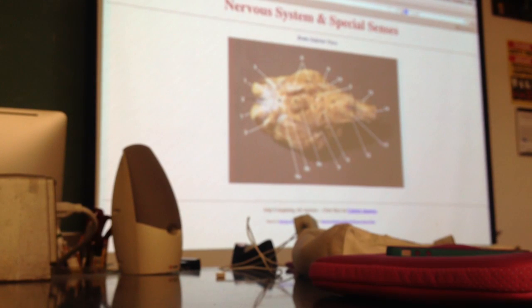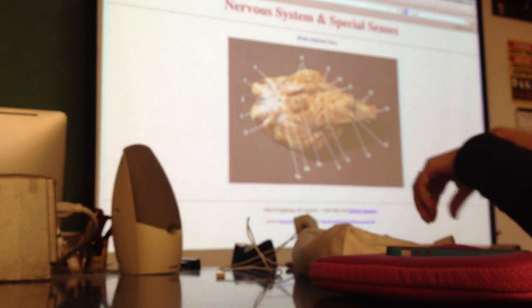Now, most of ours are cut right here, right where that 4 is, so we don't have these nice long optic nerves coming off of most of the brains. It just starts at the optic chiasm, which is this X portion right here. So you may simply have an optic chiasm present and not optic nerve presence on your models.